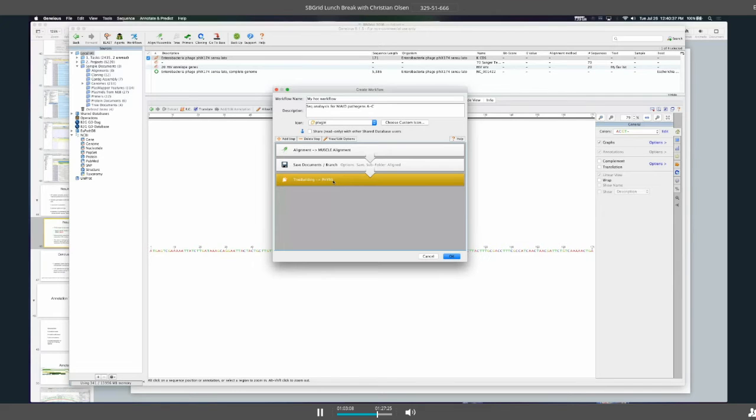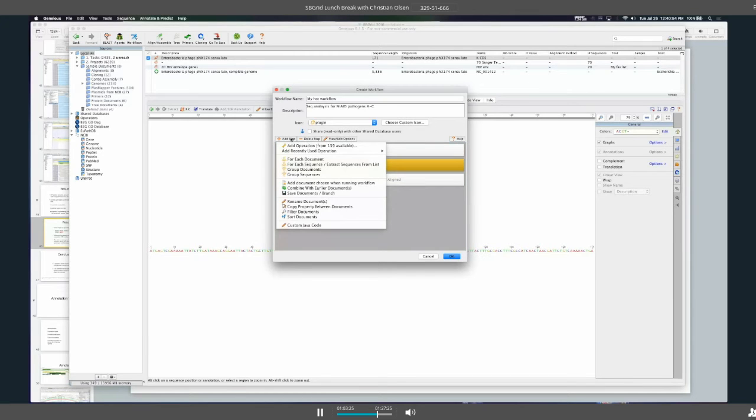If I have lots of steps and I want to move them around in a gross way, I can simply drag and move the steps around. Okay. So my recommendation is to get on a whiteboard with your colleagues, rough out the steps, and there you can start refining the steps of your workflow.